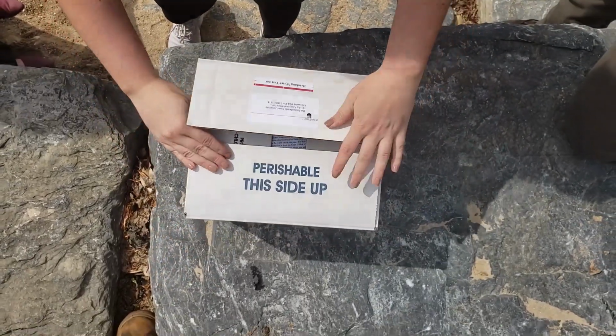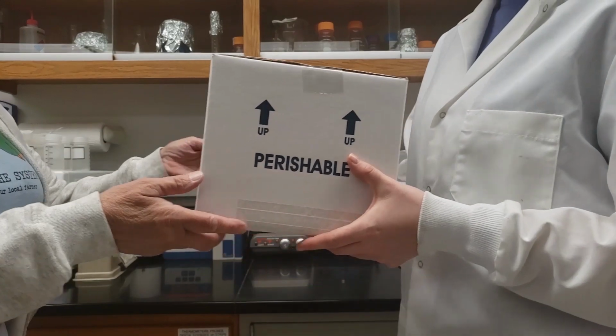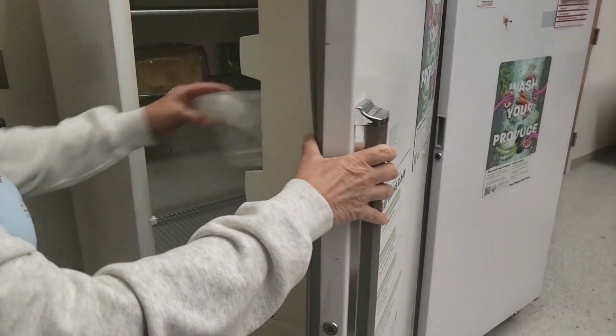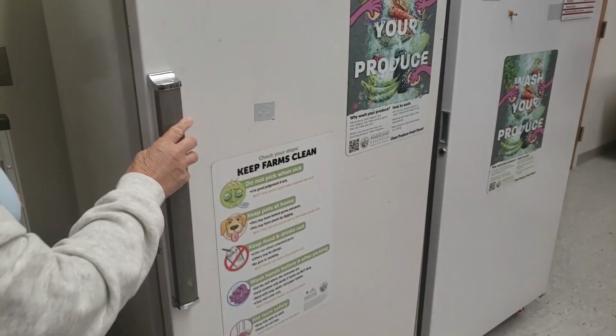Seal the box and overnight ship or deliver your samples to your lab immediately. If you cannot ship samples right away, store them in the fridge, not the freezer, until you can ship them.